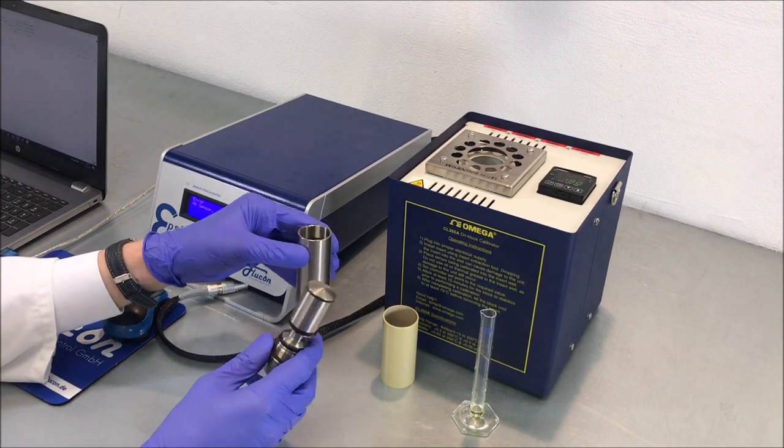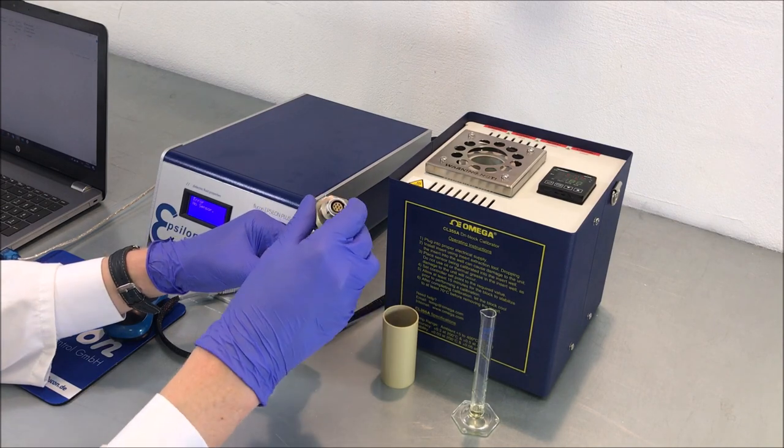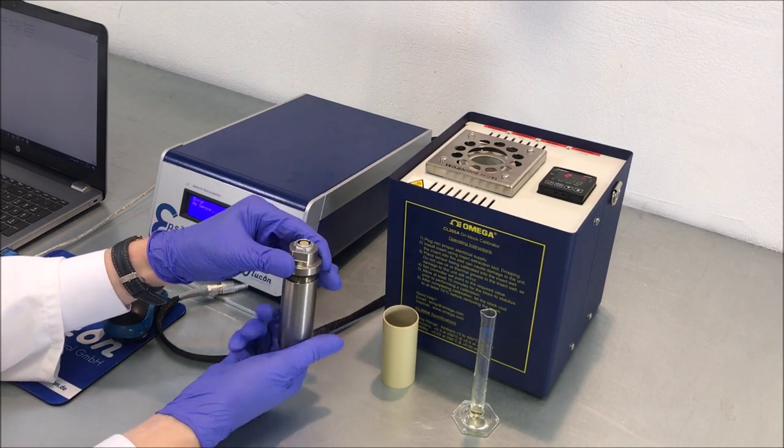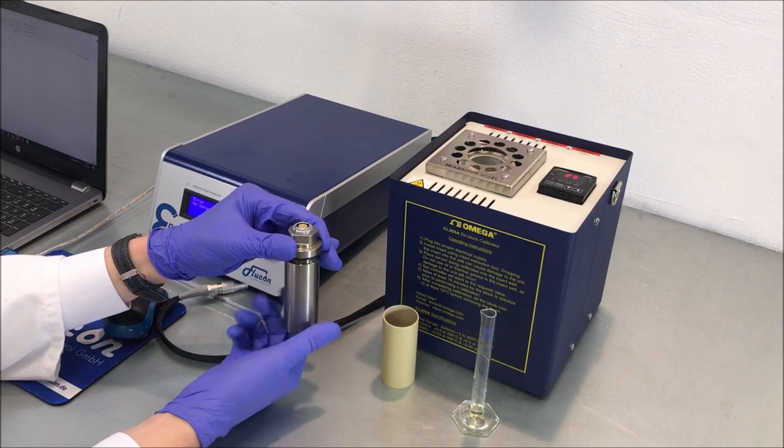Now grab your Epsilon Plus sensor head and immerse it gently into the sample. Screw on the cup with slow and steady turns.